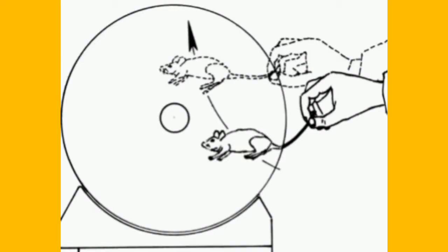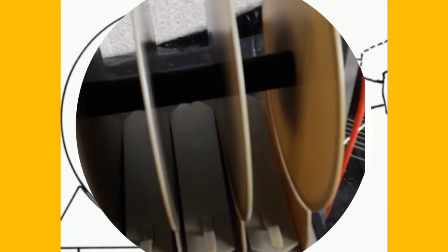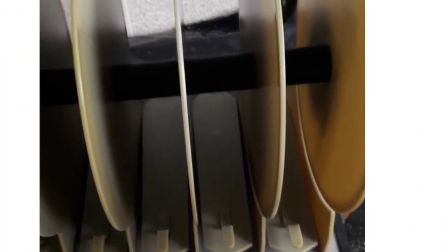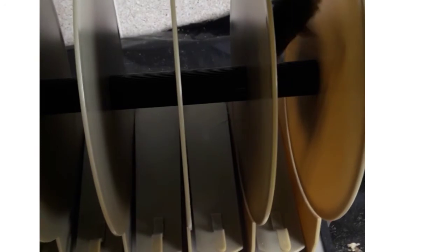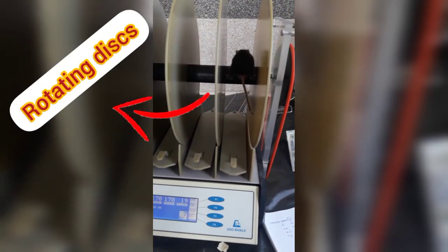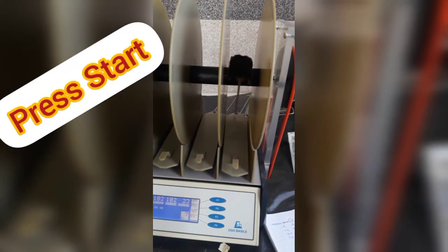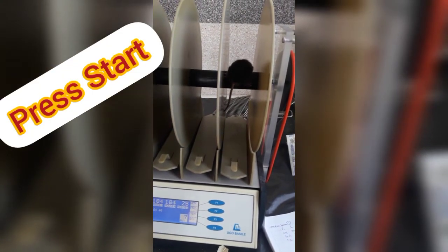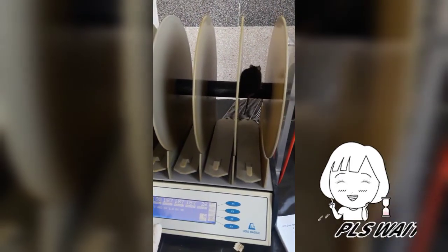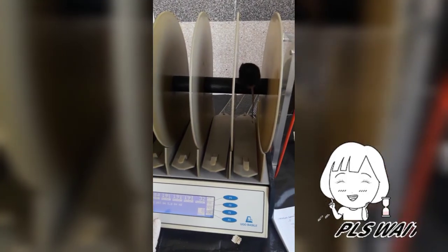You only have to grasp the mouse by the tail and place it on the rod. It may sound easy, but it's a little bit tricky. To do it easily, you need to flip the mouse up by the tail, right side up but dorsal side first, so the mouse can't grab the rotating disc. Then just press the start button and that's it. Now you just have to wait — the rod will accelerate based on your setup, and when the mouse falls the timer will stop automatically.